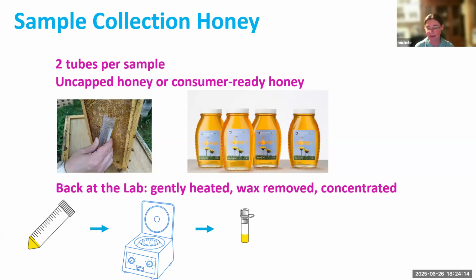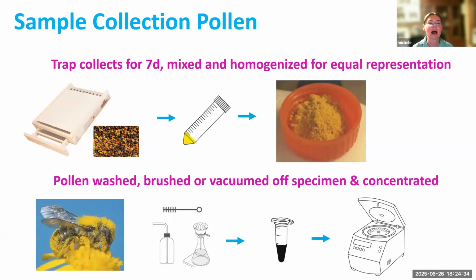It's not a problem for what I'm doing. And then the sample, I take that 50 ml tube and I literally concentrate it down in this itty bitty teeny tiny tube. Believe it or not, that's actually one of the most laborious parts of dealing with honey, the concentration. It takes about 4 hours for me to go from 2 50 ml tubes down to an itty bitty teeny bit of material.